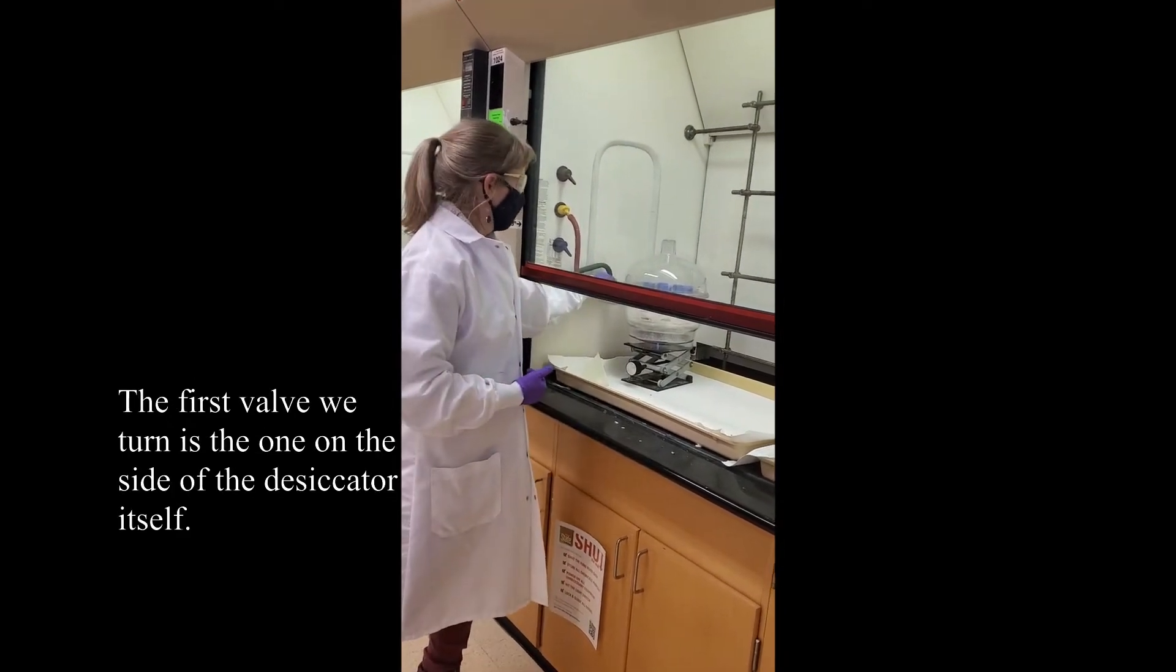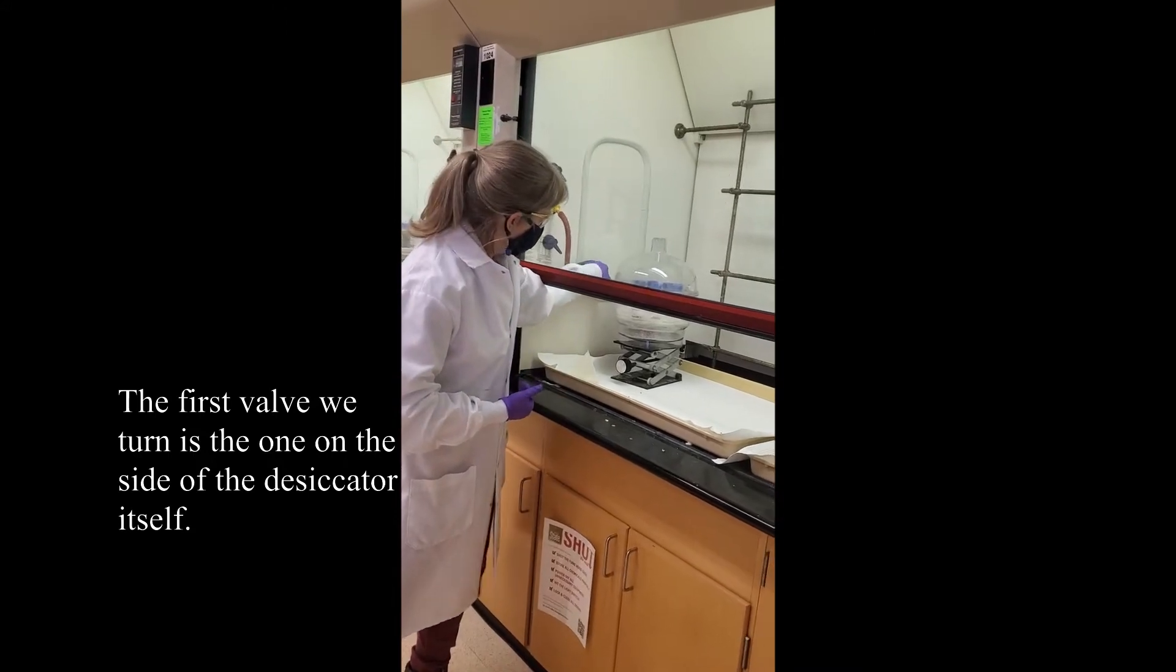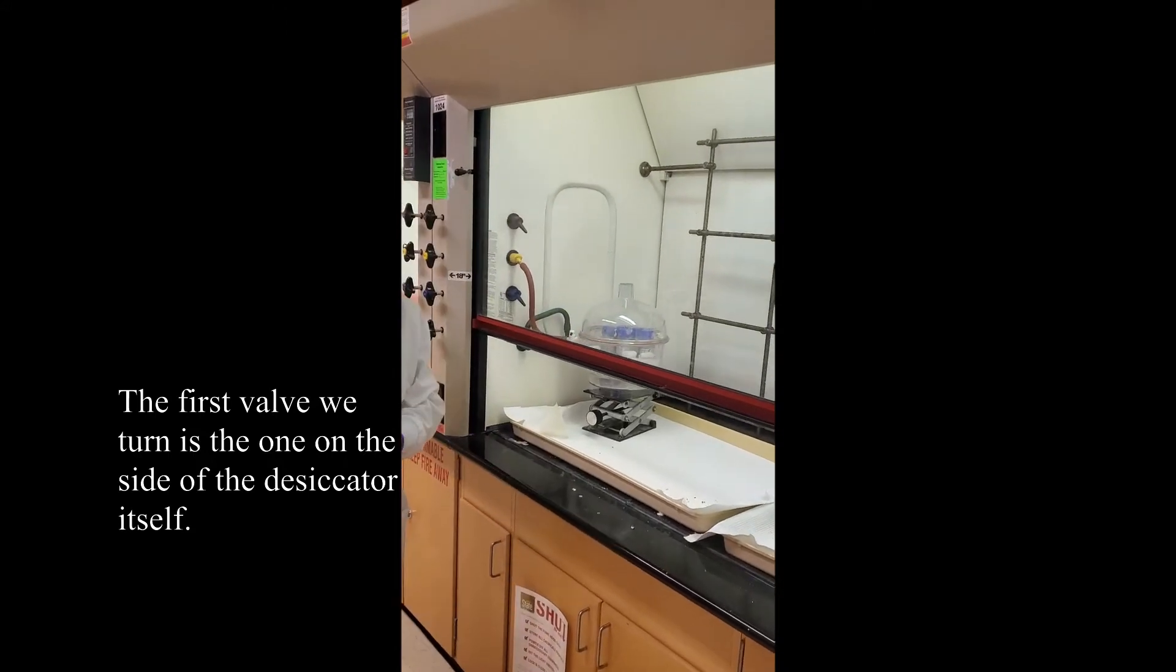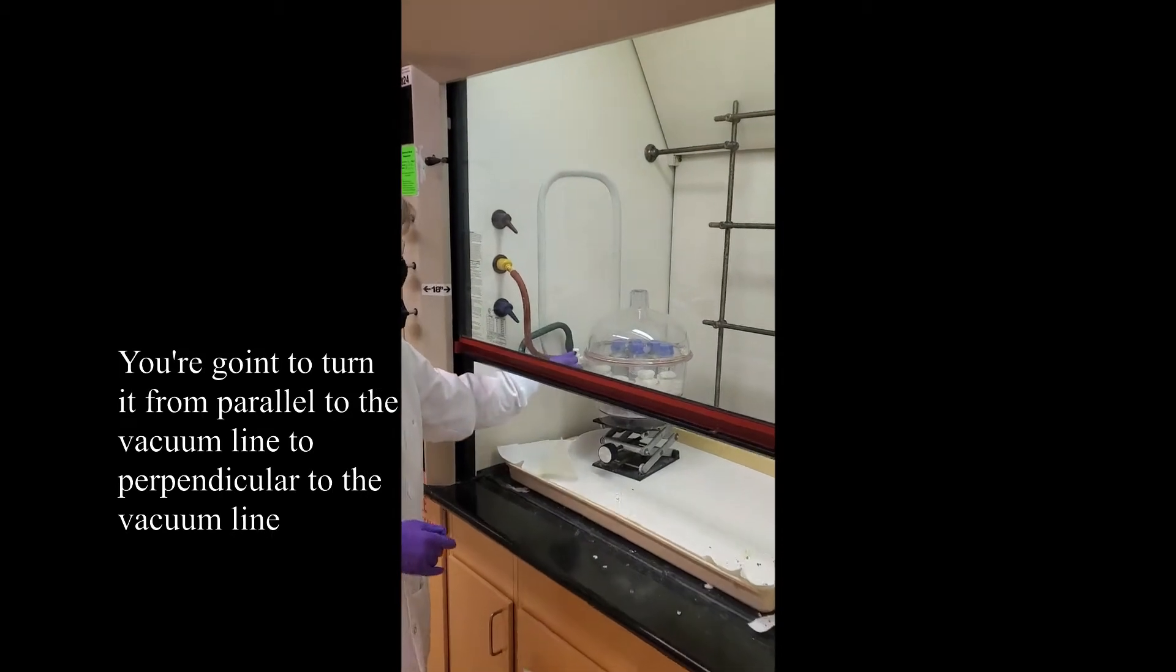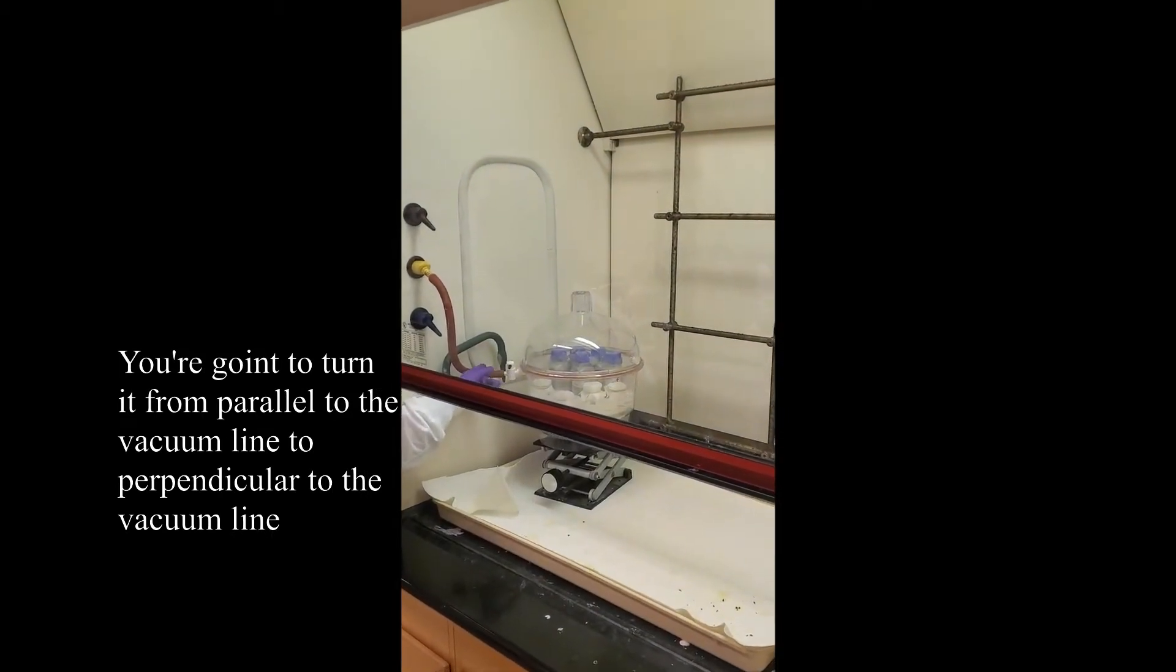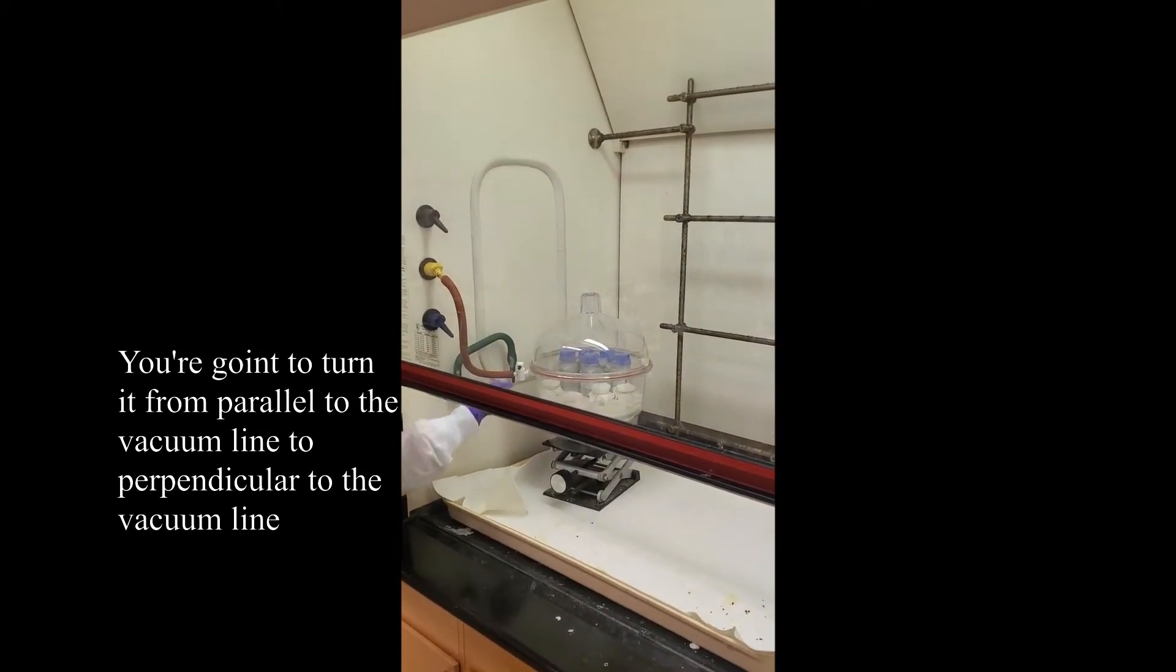The first valve we turn is the one on the side of the desiccator itself. We're going to turn it from parallel to the vacuum line to perpendicular to the vacuum line.